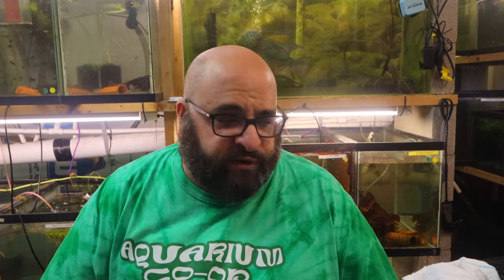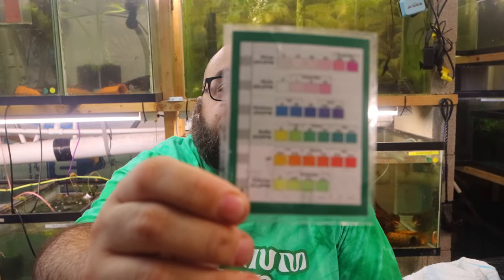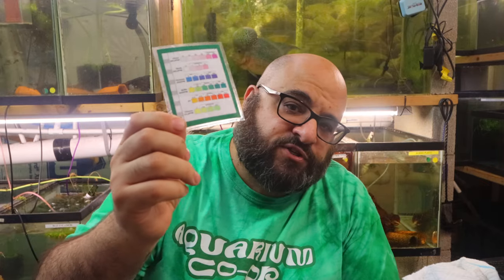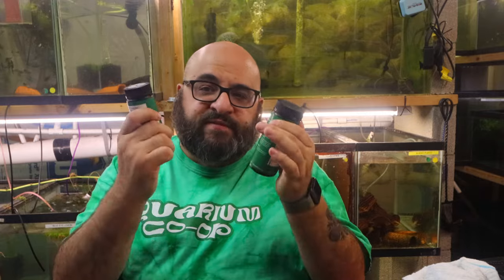Here's the color chart for the API Master Test Kit, and here's the chart for the Aquarium Co-op multi strips. The multi strip tests five or six different things. Then there's a separate test for ammonia. You might be wondering why ammonia is separate — are they just trying to make us spend more money? The reason is simple: the chemical on the pad for ammonia would make most of the other pads on the multi strip inaccurate, so they have to be separated.